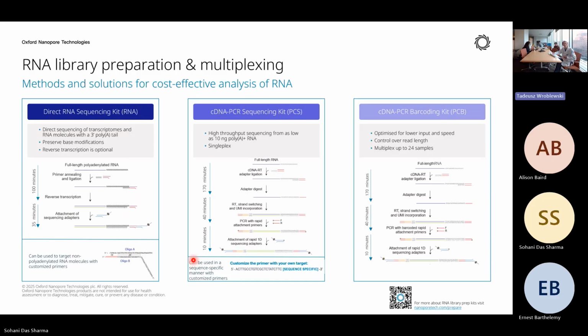It is very hard to maintain how many A's are getting added. So there are several different troubleshooting steps you might need to do if you are interested in exploring small RNA sequencing, specifically using this platform.